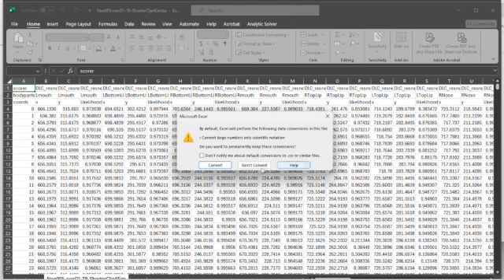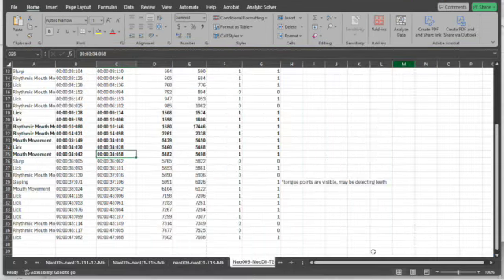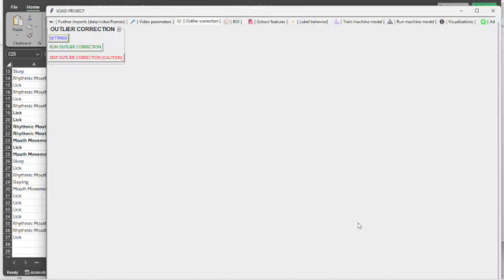Manually, you can delete any columns. Let's say I didn't have the right mouth in my body part list. I would manually delete these columns and then save this CSV in exactly the same location. Otherwise, this next step will not work if you have a mismatch in the number of body parts in your DeepLabCut output and your body part list.